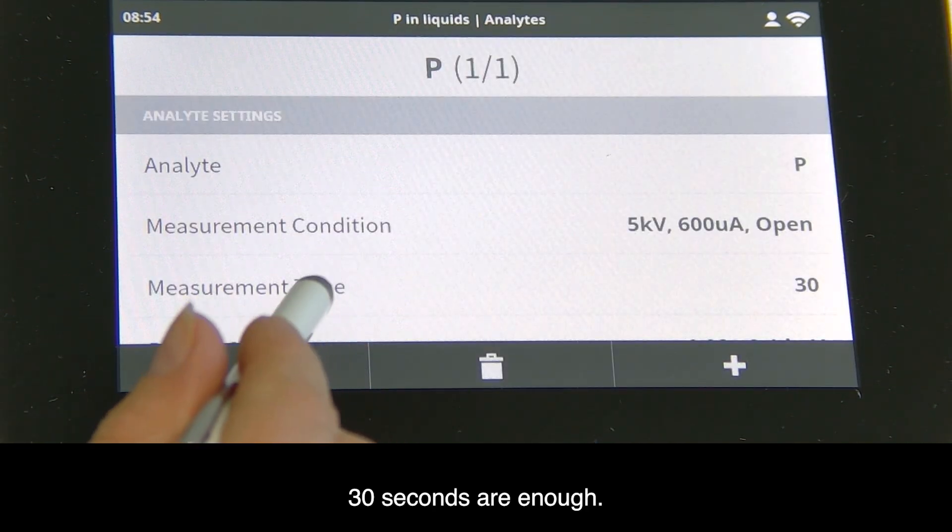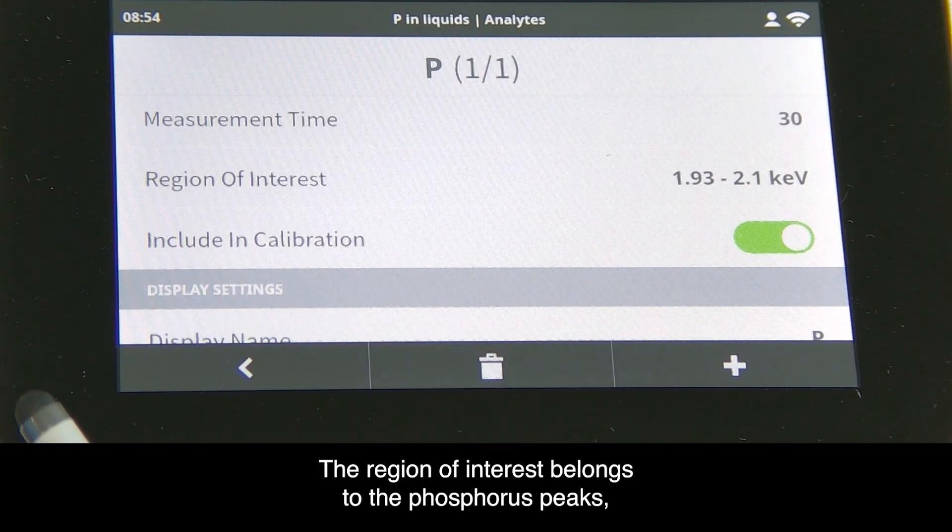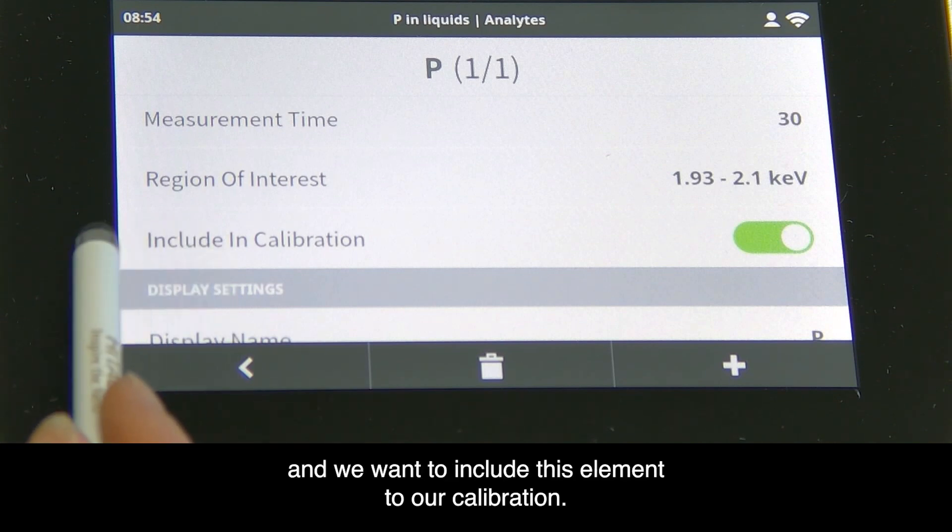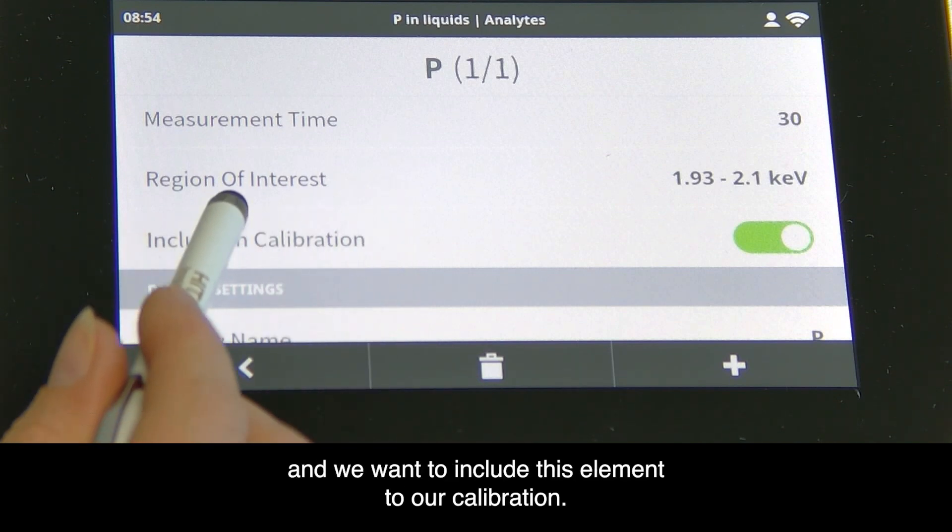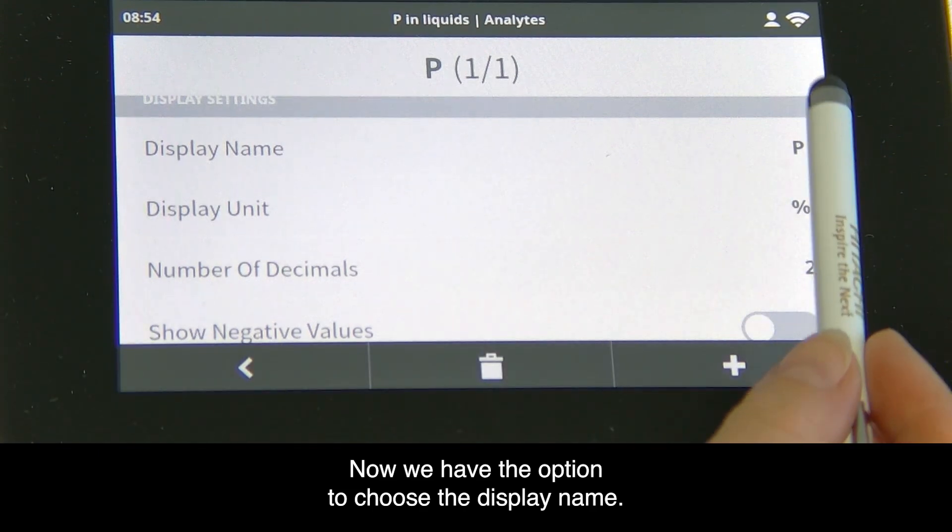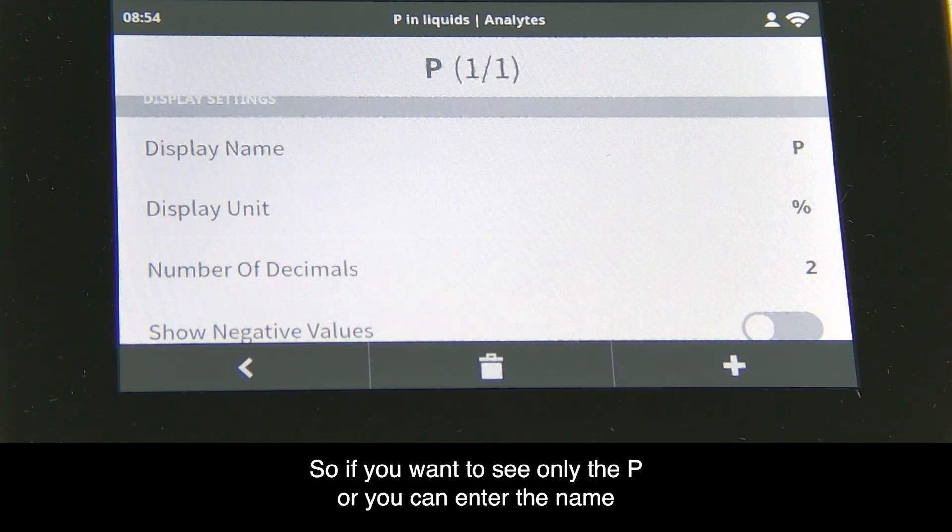The region of interest belongs to the phosphorus peaks, and we want to include this element in our calibration. Now we have the option to choose the display name.